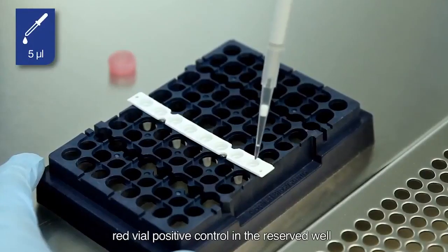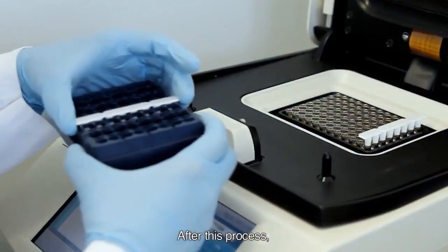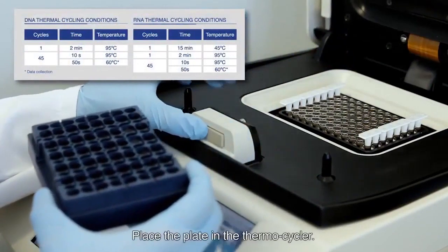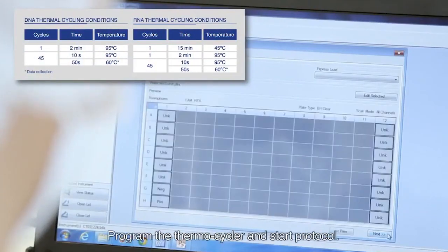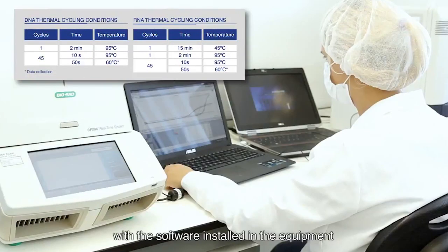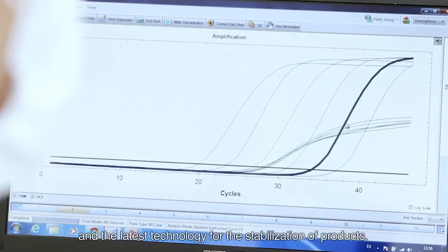Cap and close the wells. After this process, move the plate to the real-time PCR equipment. Place the plate in the thermocycler, program the thermocycler and start the protocol. When finished, analyze the results with the software installed in the equipment.